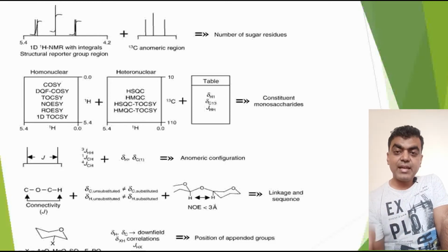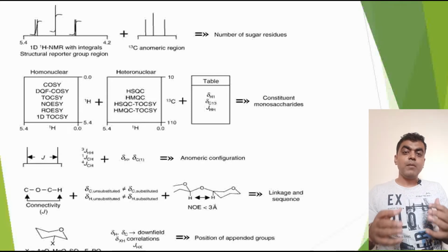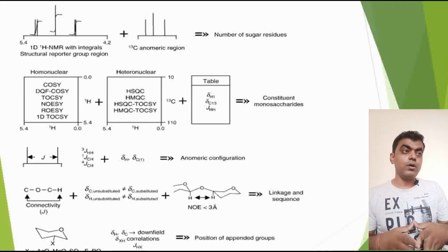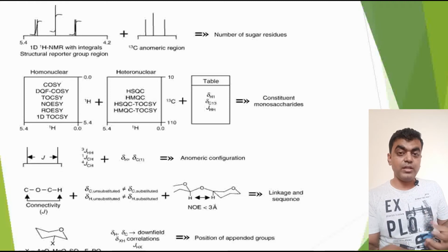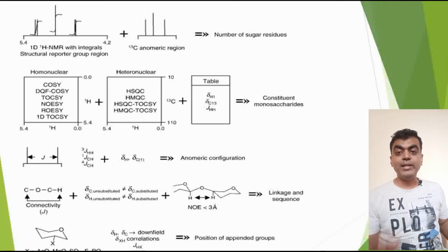So whatever peaks are there, if you integrate, or the area under the peak, to be very simple, if you can find that value, that will give you an estimate of the concentration of the particular compound you are studying, maybe a pure protein, maybe a steroid, maybe a terpene, whatever it is. So all this you can quantitate.